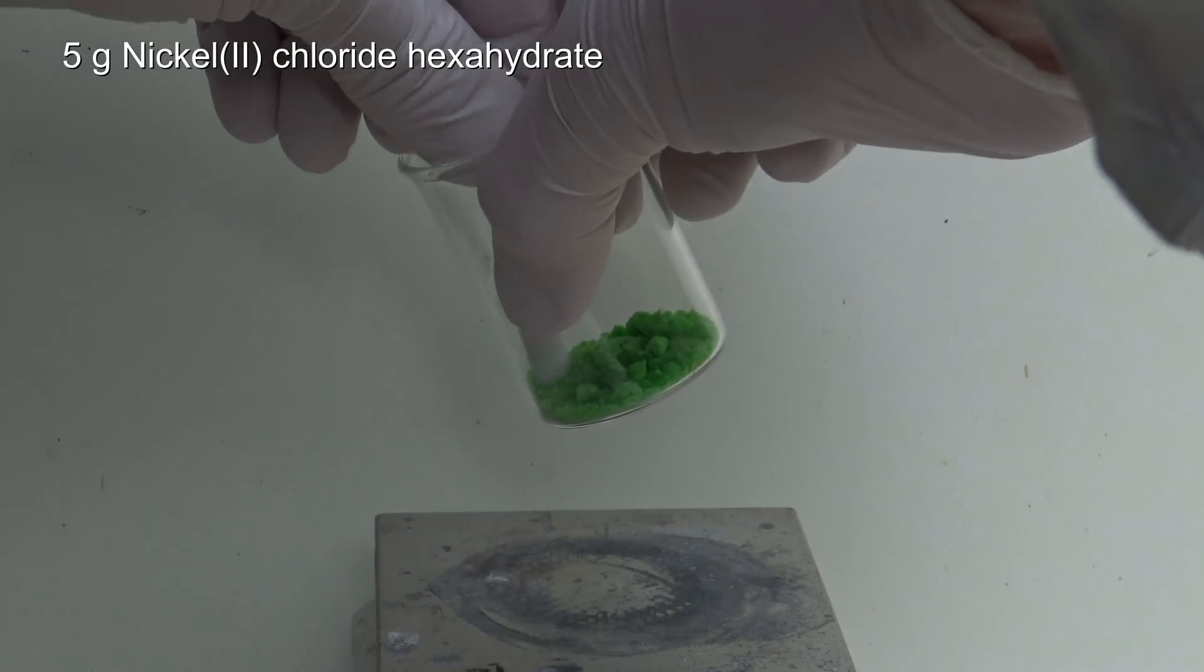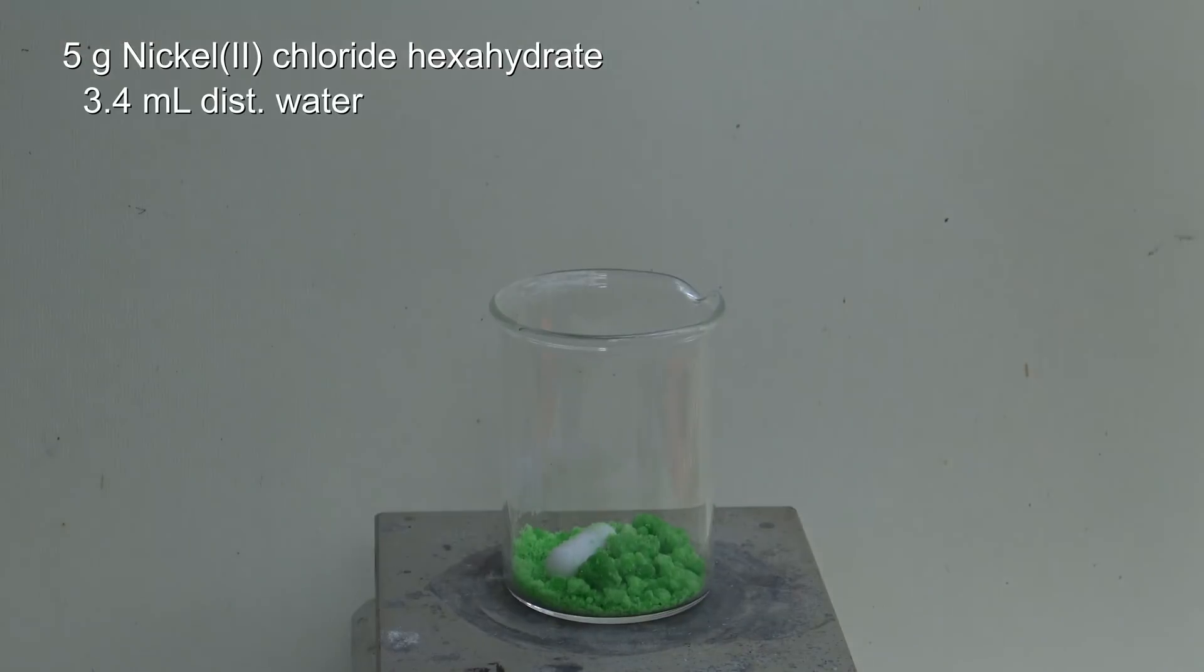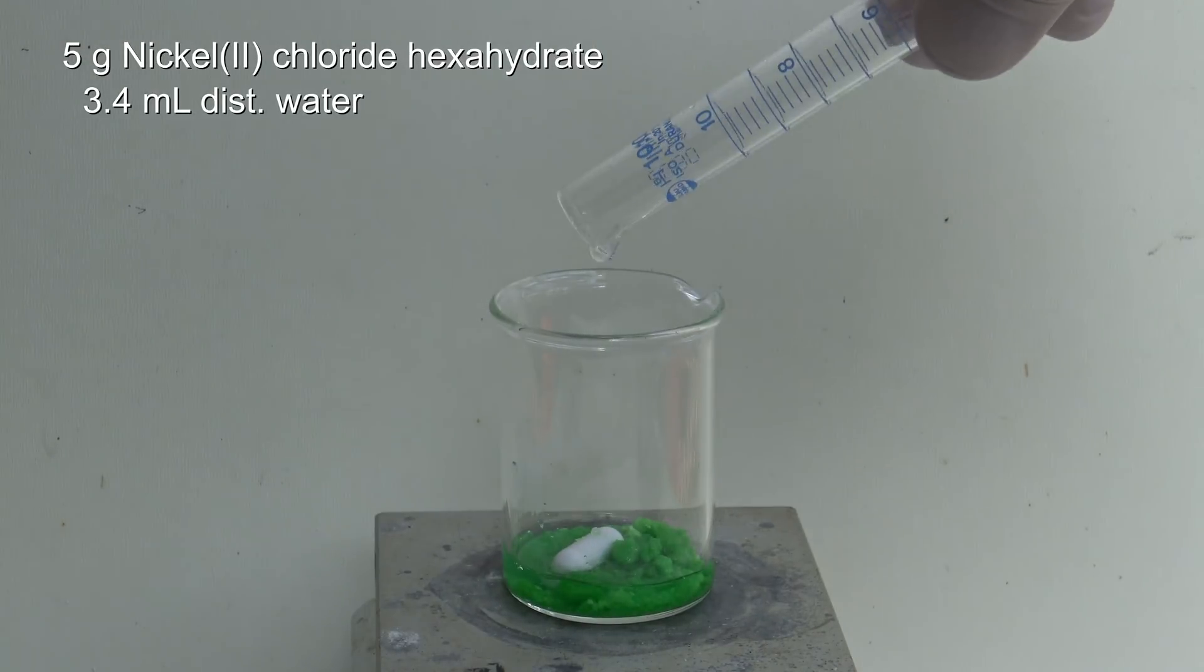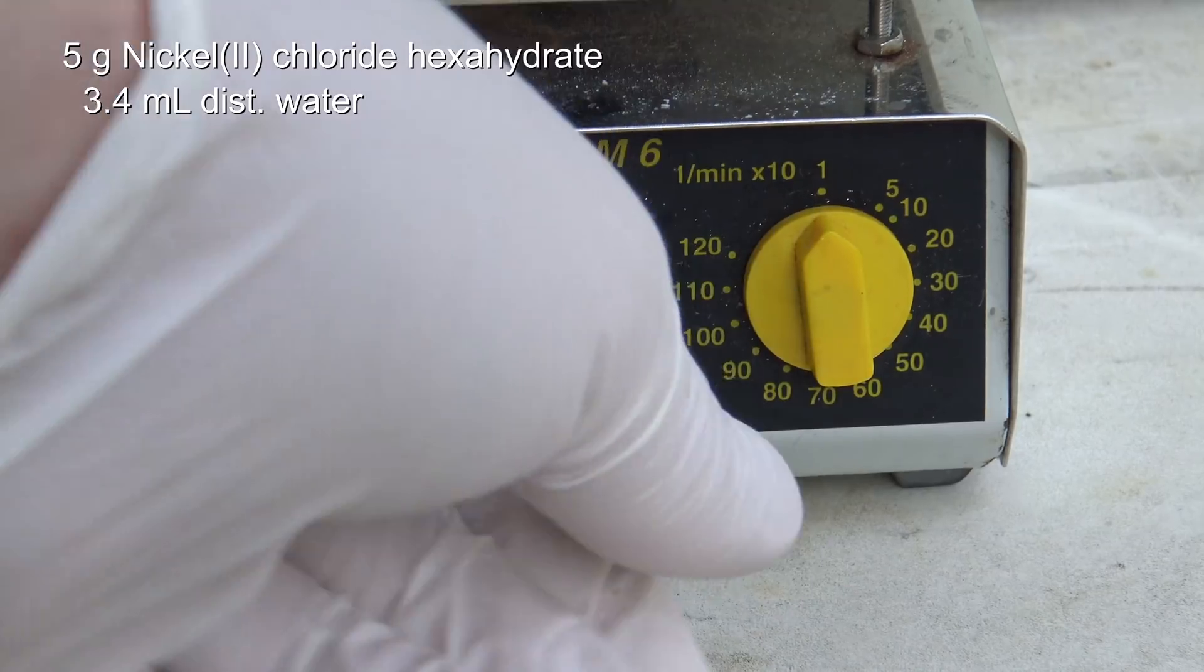Then, 5 grams of nickel chloride hexahydrate were dissolved in 3.4 milliliters of distilled water. This took about 15 minutes even though the mixture was stirred.